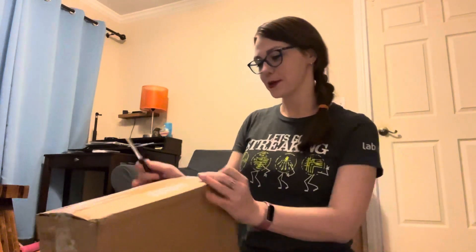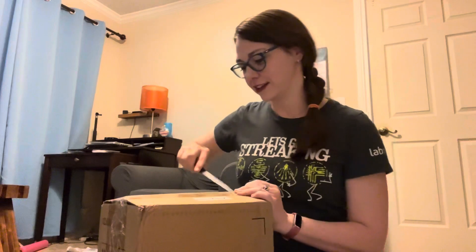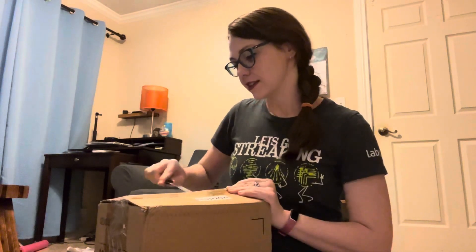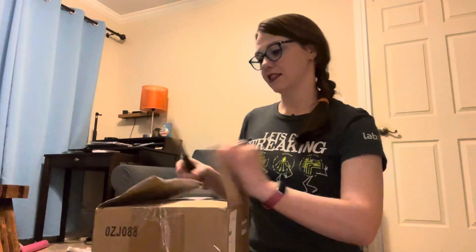I was going to wait until my boyfriend Steven got home to do this, but I've been waiting for this to come in and he talked me into buying my very own fancy microscope. I'm going to open it and he can watch the video later, because I've been waiting for several hours and I don't think he's going to be home anytime soon. This is an eBay purchase — you can find anything on eBay.